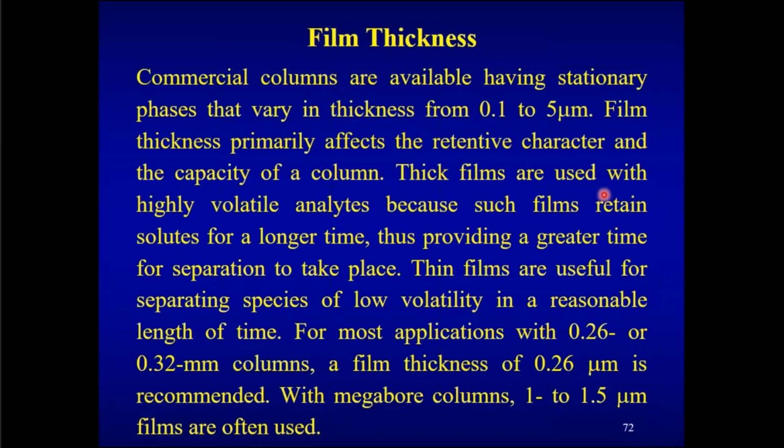Thick films are used with highly volatile analytes because such films retain solute for a longer time, thus providing greater time for separation to take place. It's the same thing I told you: thicker films retain solutes for a longer time, so it gives you greater time for separation to take place. If greater time is available, then the separation would be better.